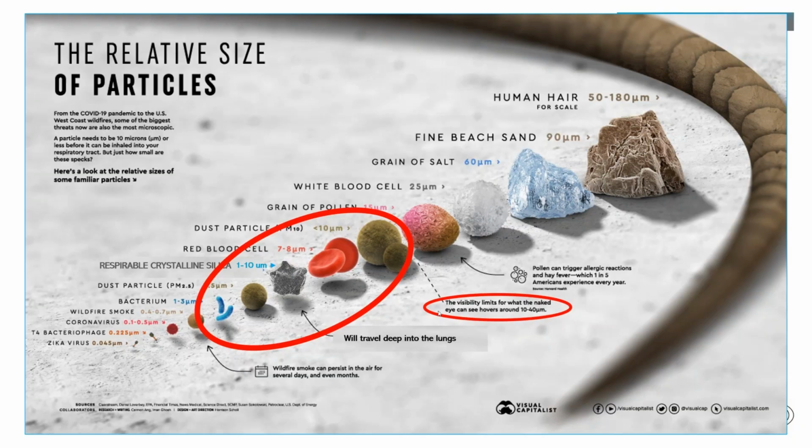And these are the sizes of particles that we are specifically trying to capture on our filters, whether that's with a cyclone or with a PPI. That's what's being sent off to a lab to be analyzed. So again, we are talking about extremely small particles that we cannot see in the air that are doing damage deep down in our lungs that takes years or decades to manifest. So sometimes it's a very hard concept for workers and management to get their head around, because you can't see it, you can't smell it, you don't know what it's doing right now, it's not hurting you right now, but it just takes a long time to manifest in our bodies.